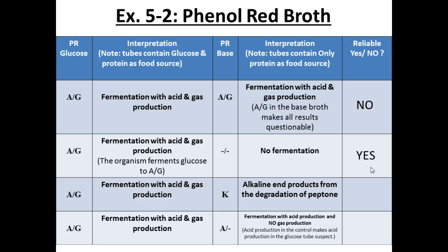But it is possible that when there's no sugar, excuse me, and only protein, the organism doesn't do anything. It just grows, and doesn't ferment the sugar or utilize the protein.